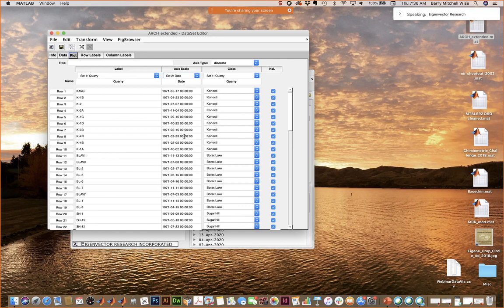Here, I actually created this one sort of at random. This data set was taken in 1971, so that's why it says that. You can also have class variables here, and you can have multiple ones of those. Here we only have one, but those classes are where the samples came from. So that's the sample mode.